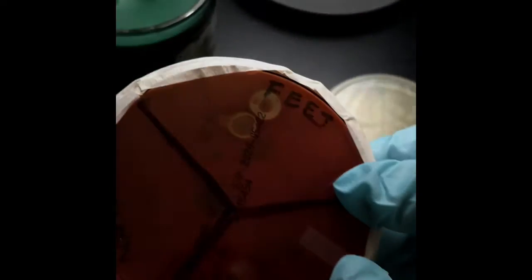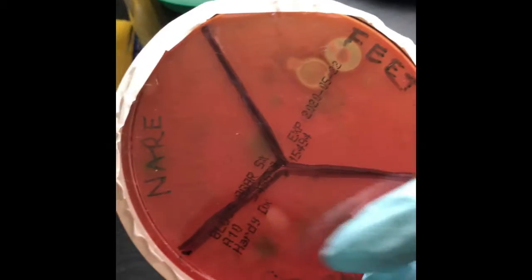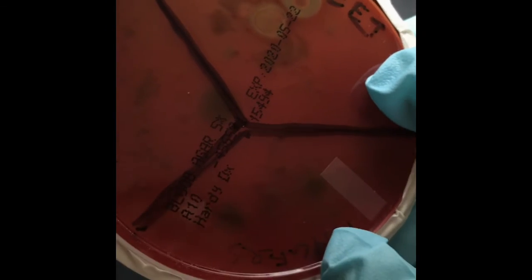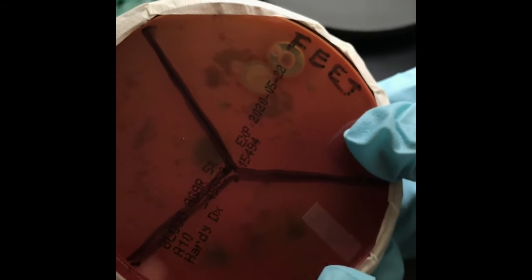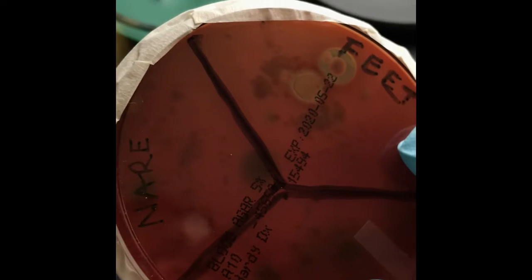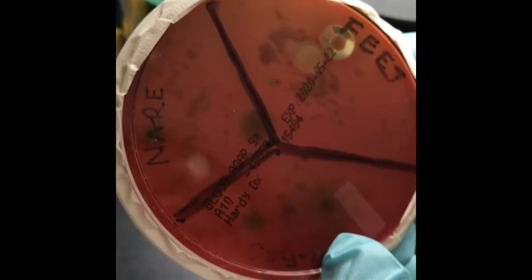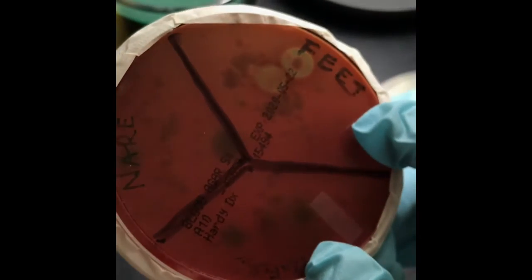Now if you look clearly, some of them are greenish colonies, like 1, 2, 3. Those are greenish colonies. Those are actually alpha hemolysis, which means partial breakdown of the blood or hemoglobin by the microbes, in comparison to beta hemolysis, which is done by the microbes that did the complete hemolysis of the blood cells.